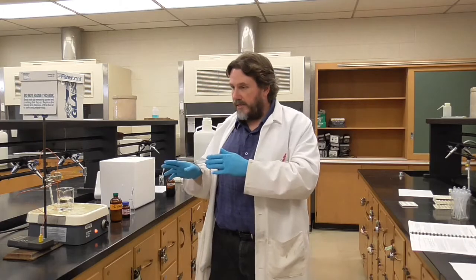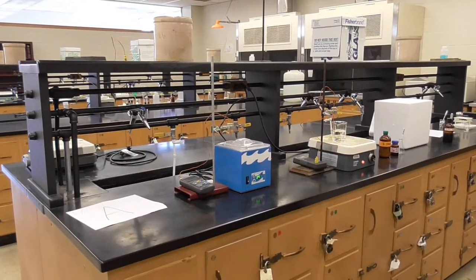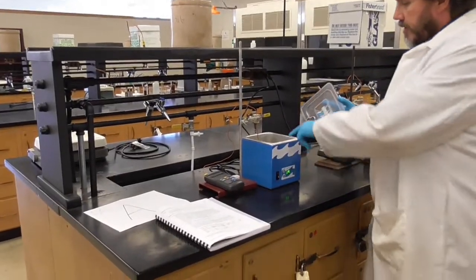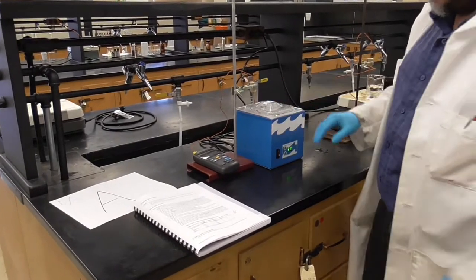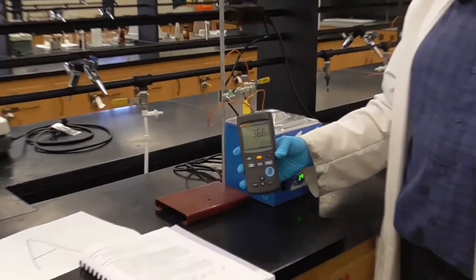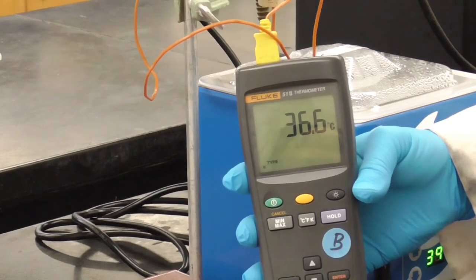So part A, let's look at that. Part A is basically preparing the solutions that we'll need and preparing the water baths. So over here, our first one, we actually have an actual little water bath here. There's just distilled water in here, and we set it so that its temperature is right at body temperature. As you can see, I've got my probe in there. 37 degrees Celsius is body temperature. And so this water bath will mimic the conditions inside the human body.